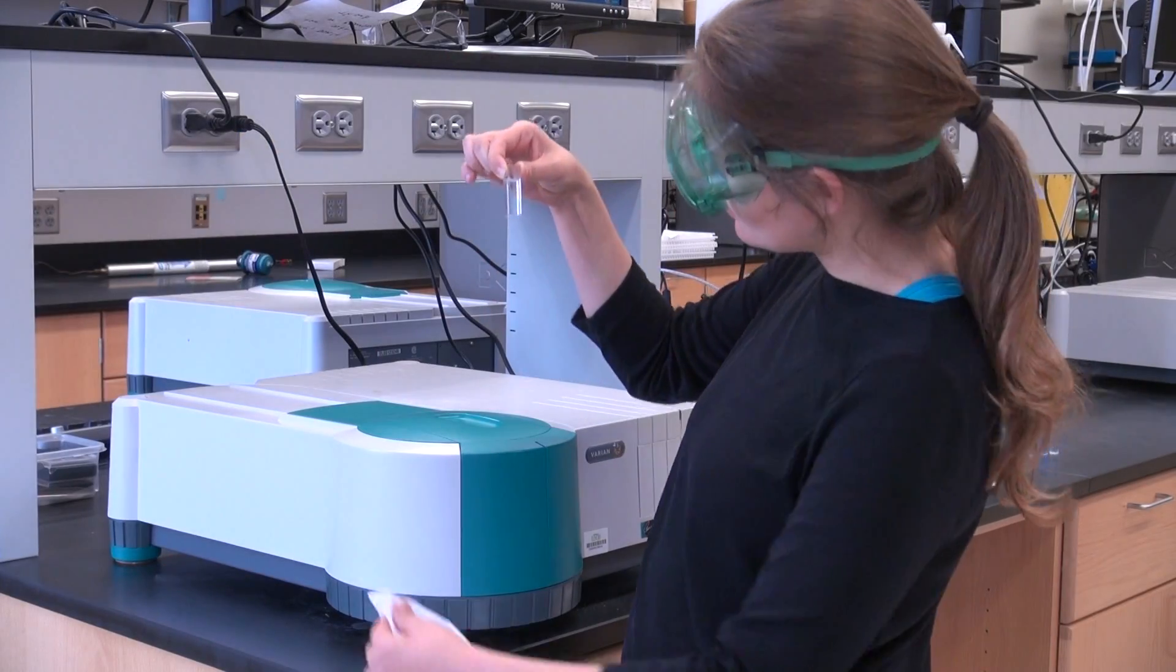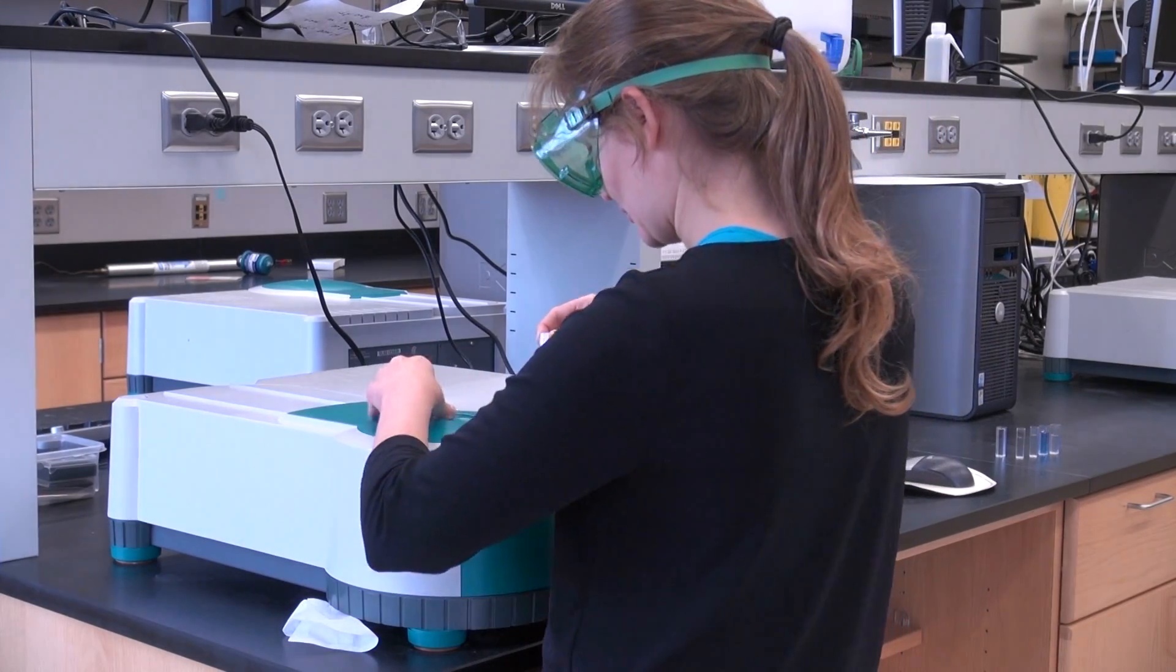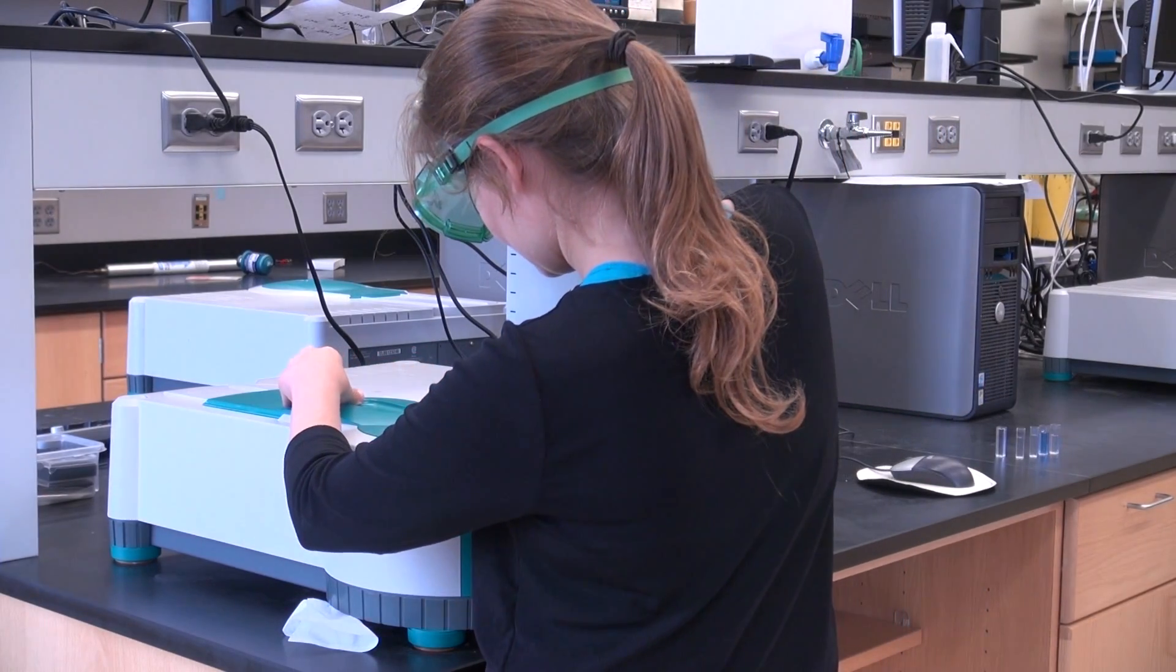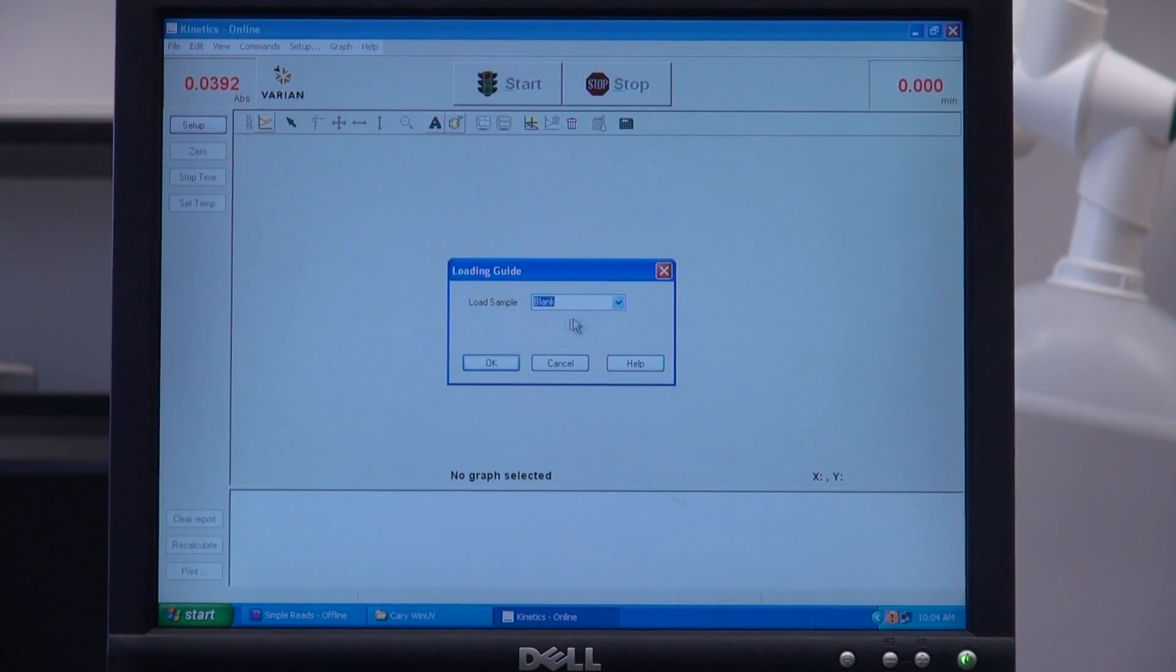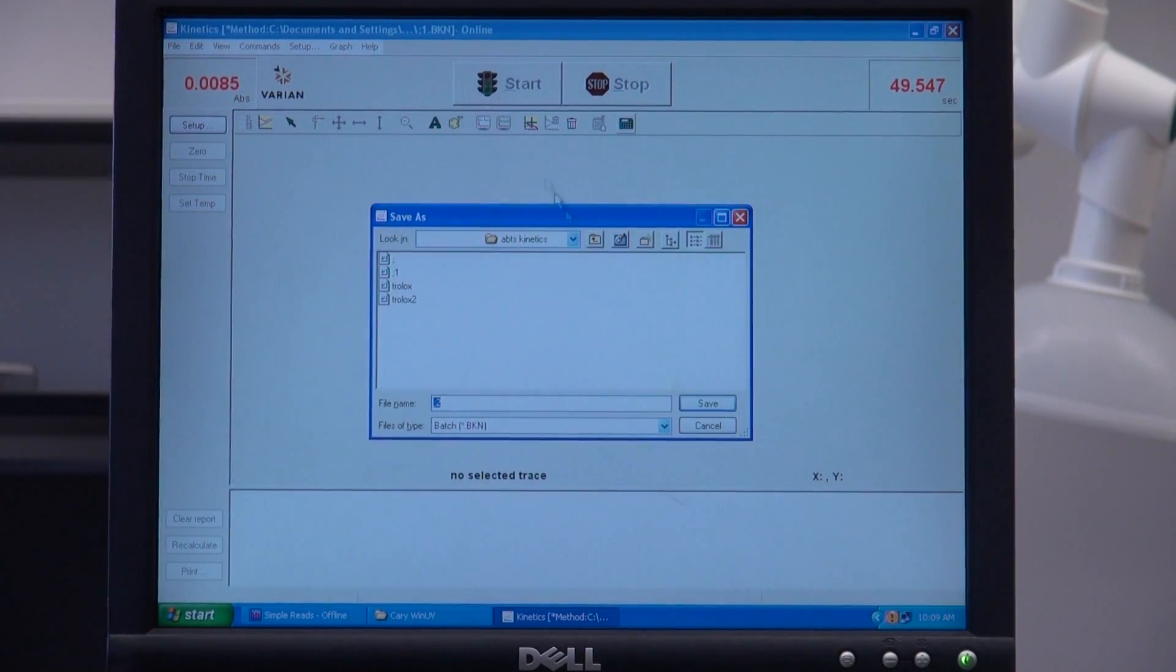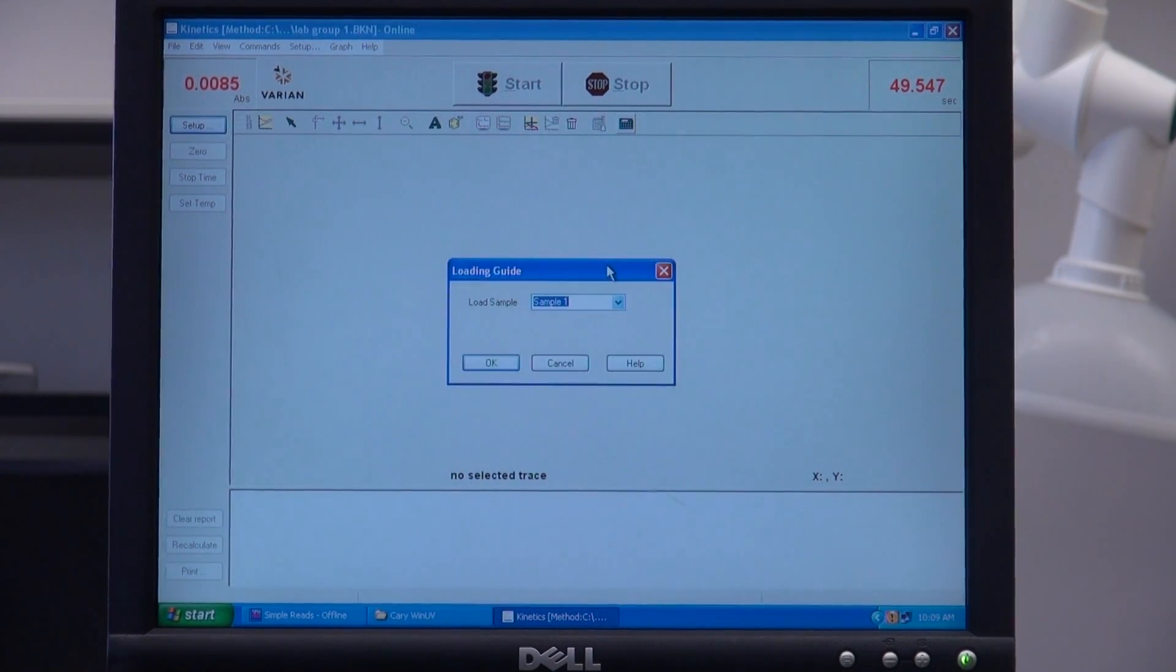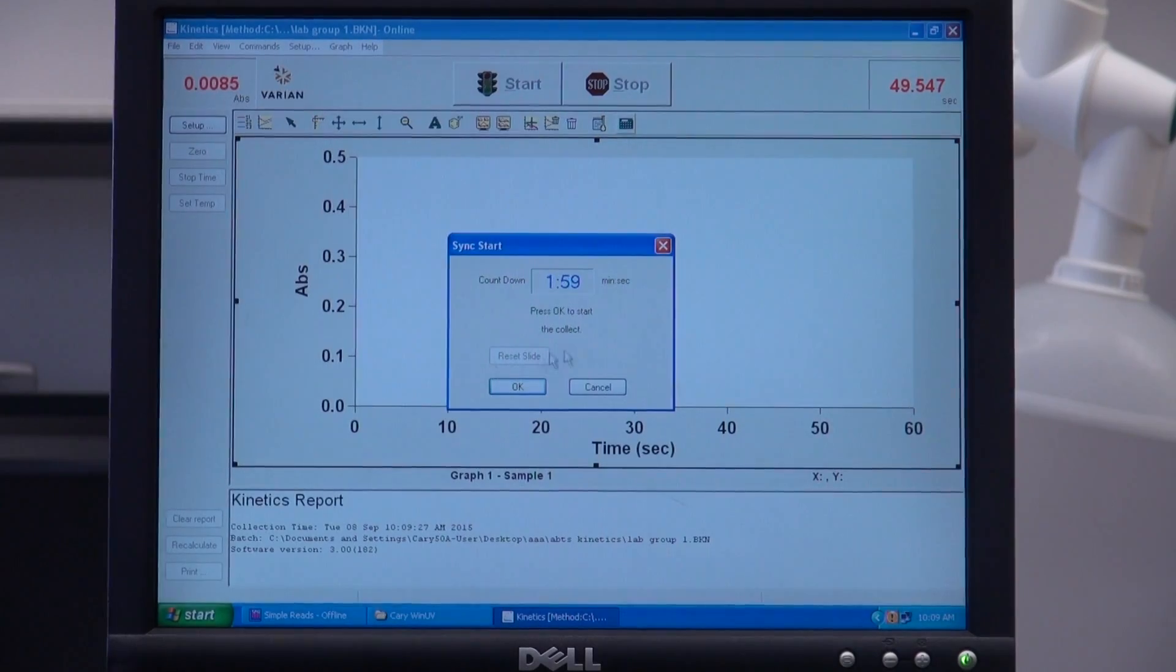You will use the sodium hydroxide solution as your blank to zero it before starting the experiment. It should say load sample. Press OK. Then press Start. You will name your file and press OK on the load sample again. A countdown for two minutes will now begin.